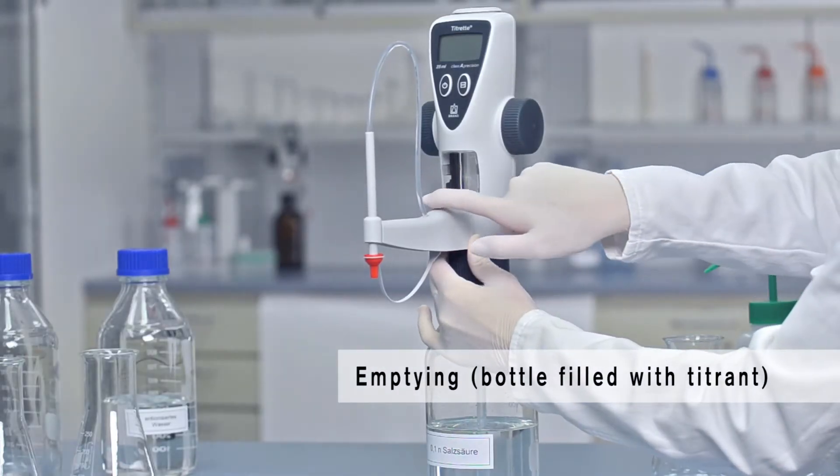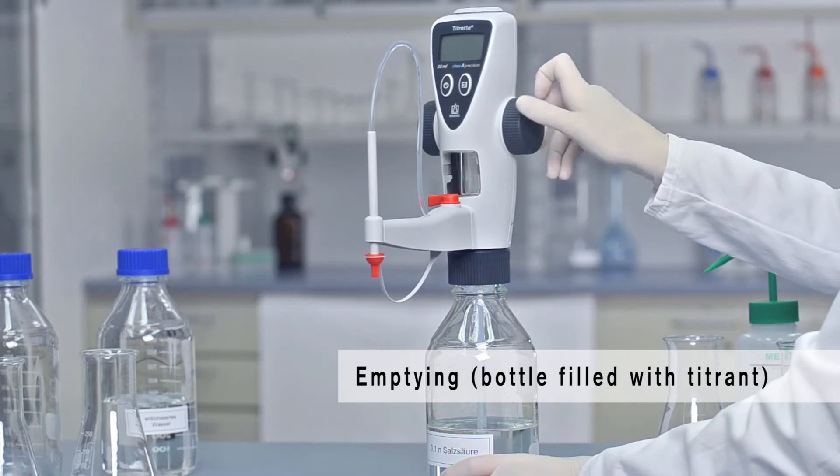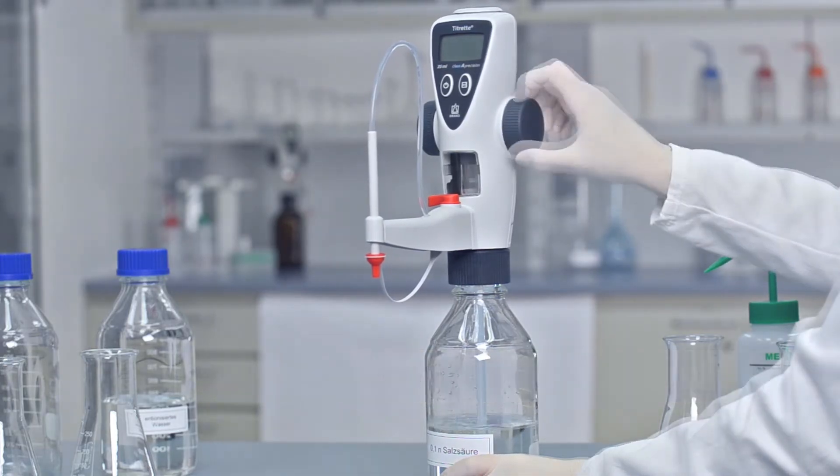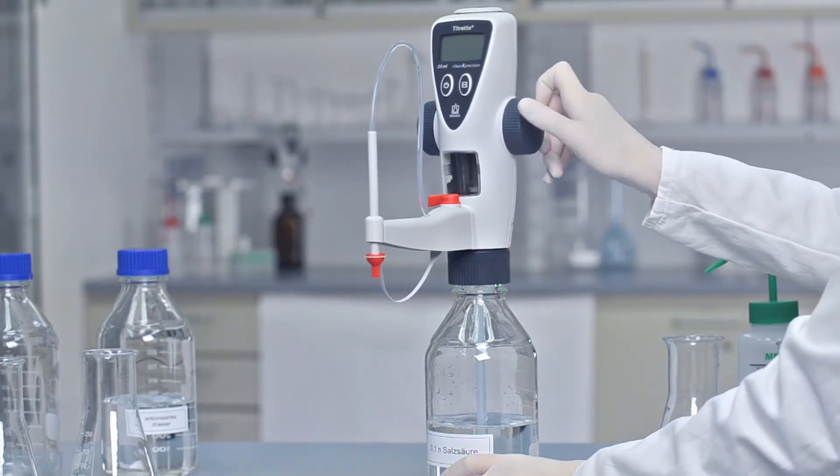First, set the valve to recirculate and empty the instrument completely. To do this, use the hand wheels to position the piston in the fully down position.